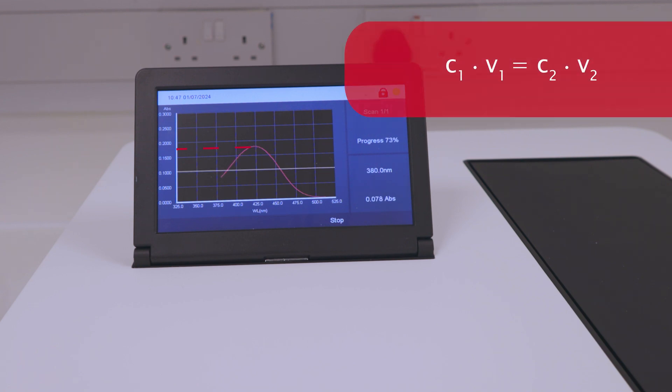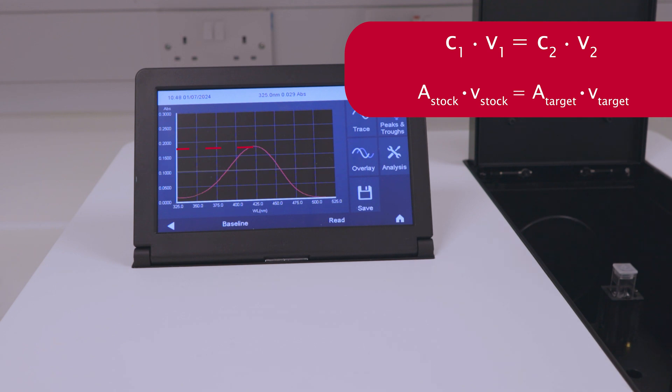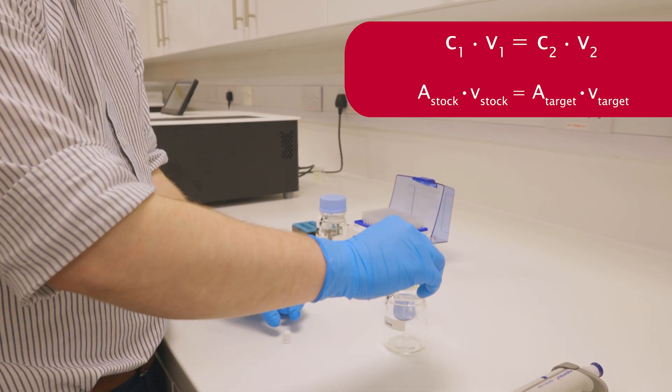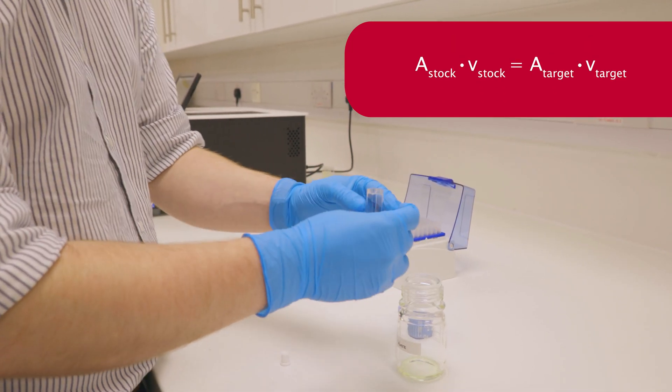To determine an appropriate dilution factor, we can use the simple C1V1 equals C2V2 equation. In this instance, C1 and V1 are the absorbance and volume of our stock solution. C2 and V2 are therefore the absorbance and volume of our target solution.